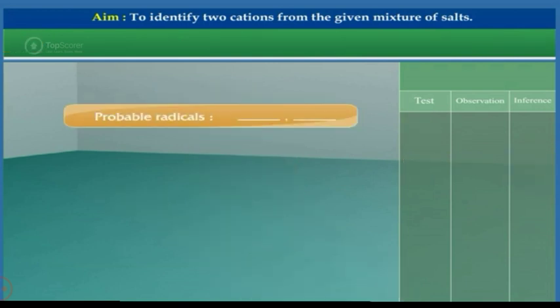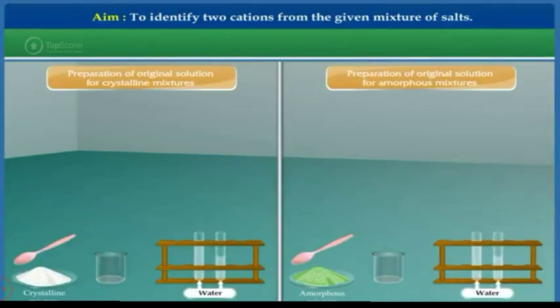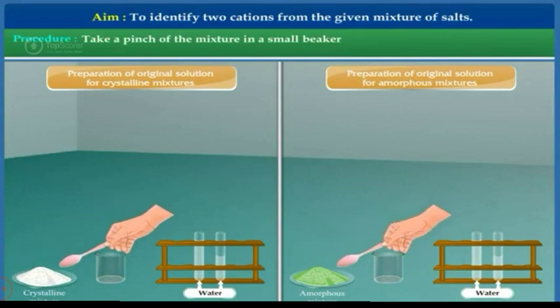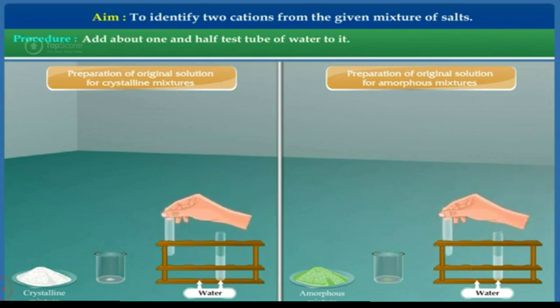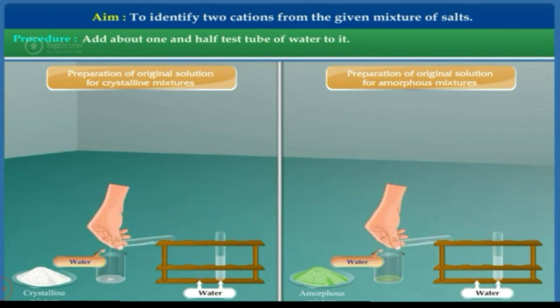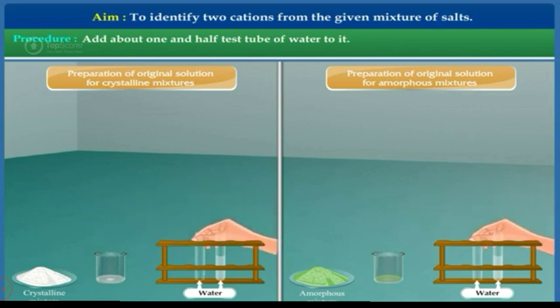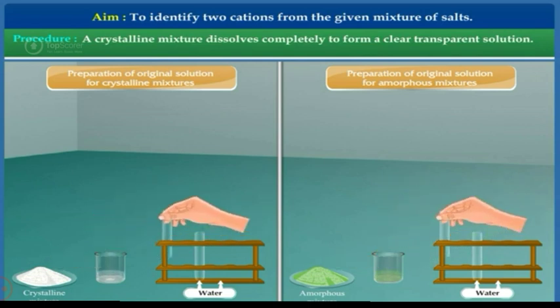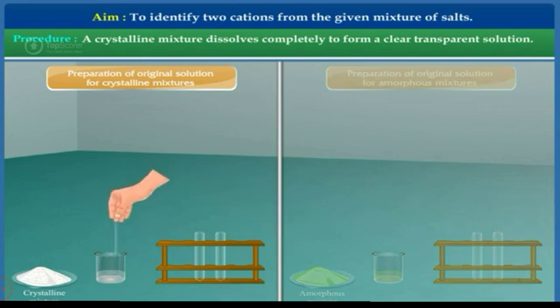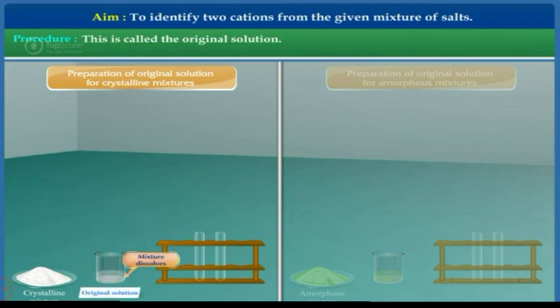Probable radicals: The probable radicals of the mixture are listed from the positive inferences of the dry test. Now we shall prepare the original solution of the mixture to perform the wet test. Take a pinch of the mixture in a small beaker and add about one and a half test tubes of water to it. A crystalline mixture dissolves completely to form a clear transparent solution, called the original solution.